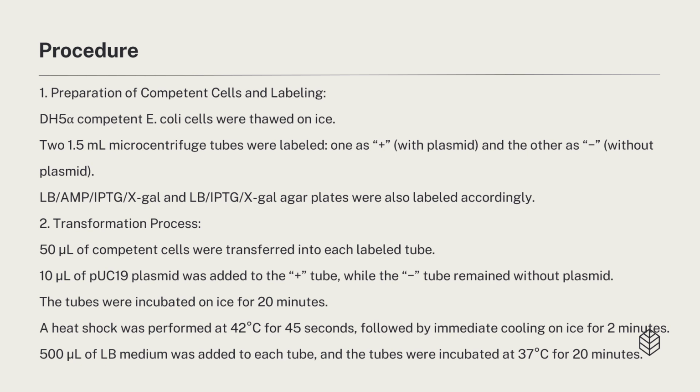The corresponding LB-AMP-IPTG-X-gal and LB-IPTG-X-gal agar plates were also labeled. And next, 50 microliters of competent cells were transferred into each labeled tube.